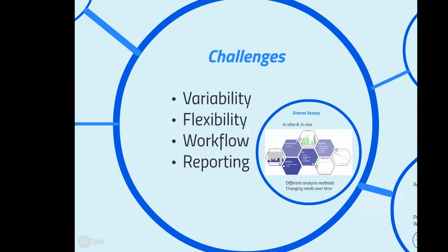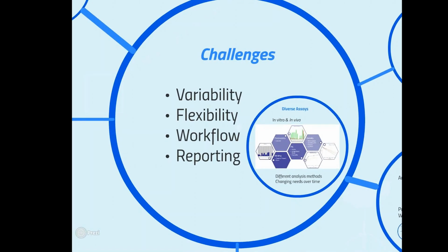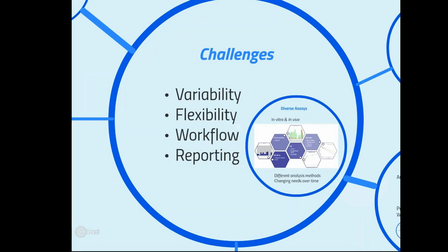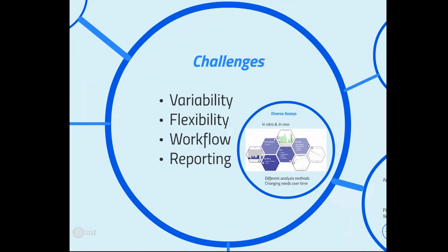So a little bit about those challenges. Well, there's 4 main areas which make delivering solutions into the in vivo and in vitro DMPK environment particularly challenging. One is in terms of variability. The second is the flexibility required to cover a number of different conditions and types of assay that are being operated in that environment. Also to meet the workflow requirements for scientists working in those disciplines. It's often not a single person activity, it's using teams of different people, whether it's in vivo, through to bioanalysis and back, or other disciplines as well. And of course also the challenges of reporting that data.